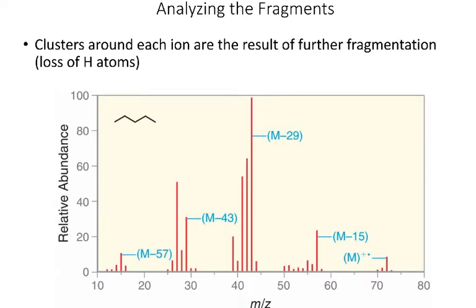All right, so here is the mass spectrum of pentane again. I have the molecular ion peak, and then a peak at M minus 15. This tells me that I've lost a methyl, and these other fragments are due to losing various numbers of hydrogens. The M minus 29, I've lost an ethyl, plus losing various numbers of hydrogens. I've lost a propyl and a butyl.